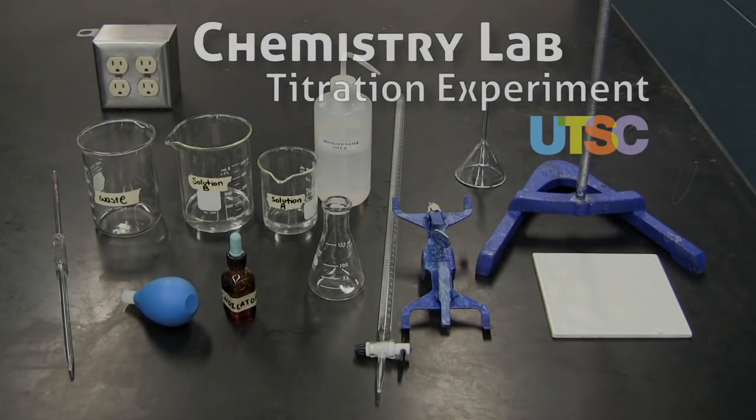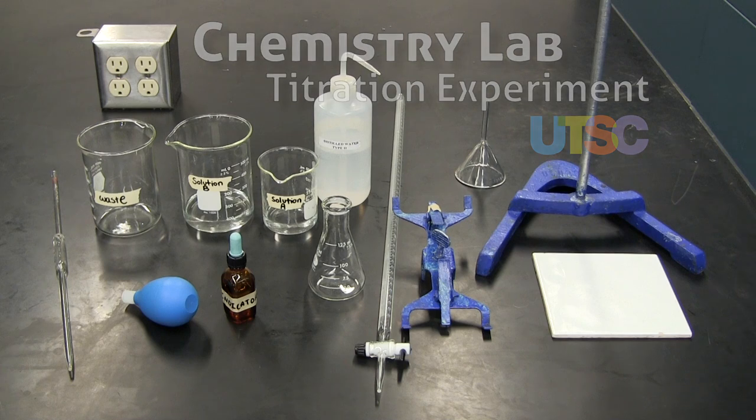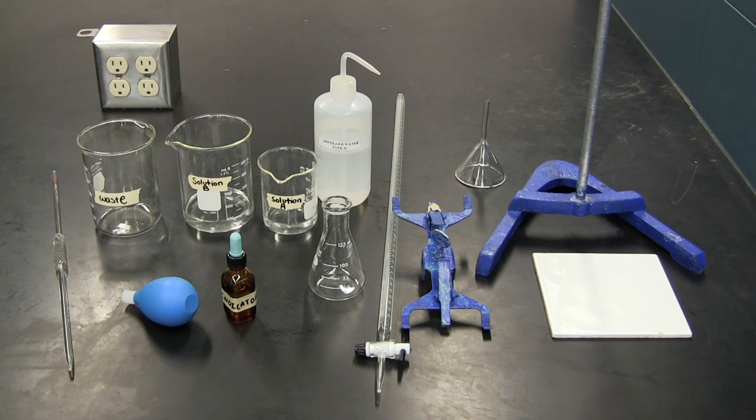This is the apparatus and materials that we will be using for the titration. The burette, pipette, pipette bulb, and burette clamp can be found along the side bench. The indicators will be provided by the TA. Everything else can be found in your drawer.